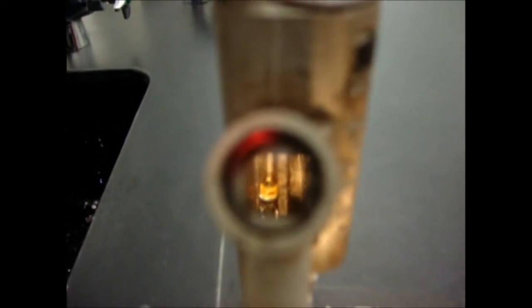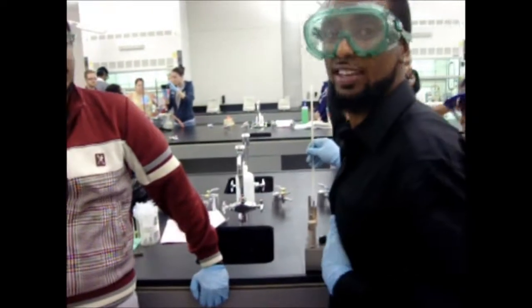Alright, going. Alrighty, so as we can see, it's starting to melt now. Actually, that is completely melted. Okay, so if it's completely melted, then we know that at that certain rate, we have the exact melting point. Hold on. Okay. And go.